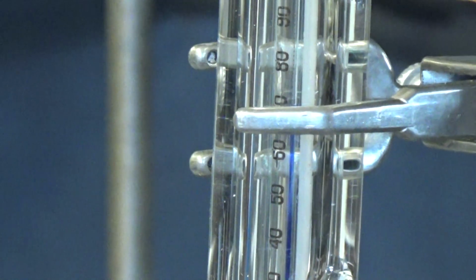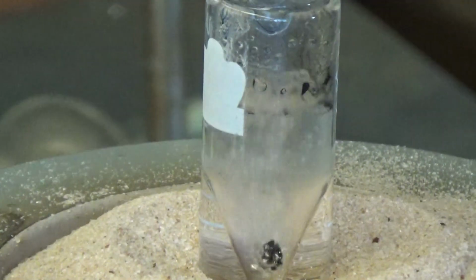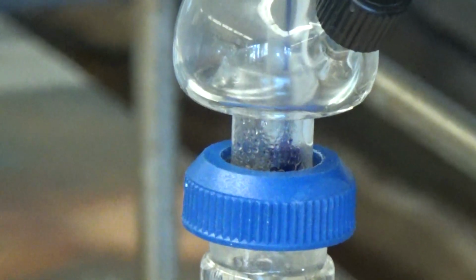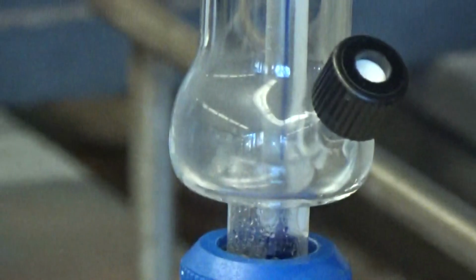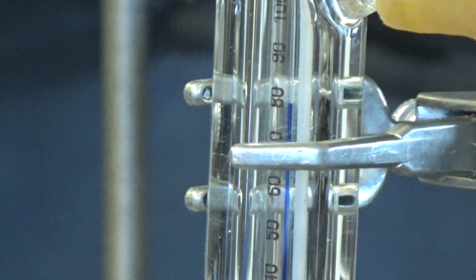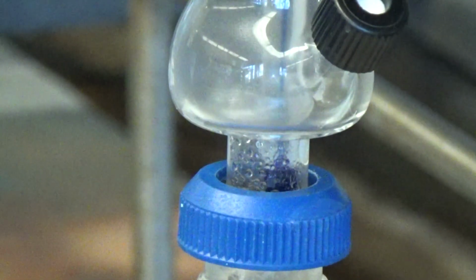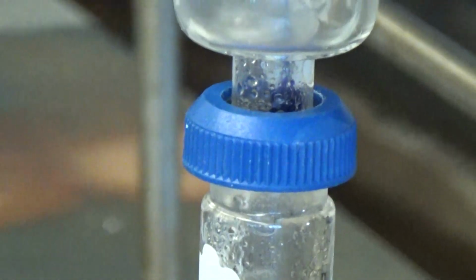I think it's around 70 now. Start to see some liquid. I see a little bit of liquid climbing up. It's getting up there. I see some condensation climbing. Temperature is almost 80 now. The liquid's climbing slowly. It's the same process: boiling, vaporizing, condensing, collecting.